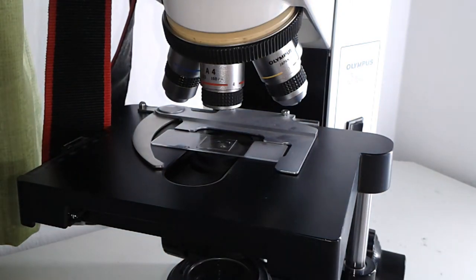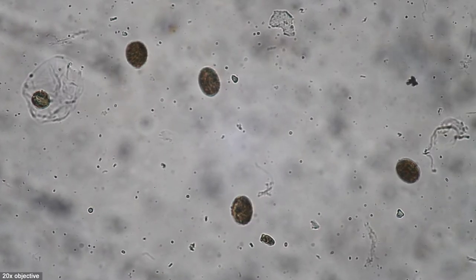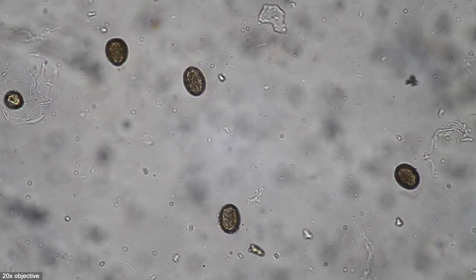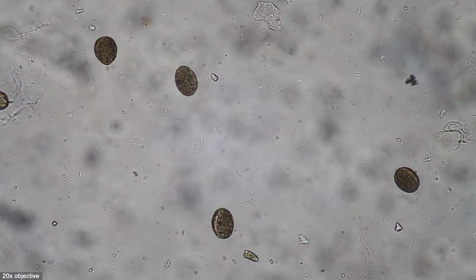And sure enough, there were plenty of pollen. That's how they look like. And this is now with a 20x objective.